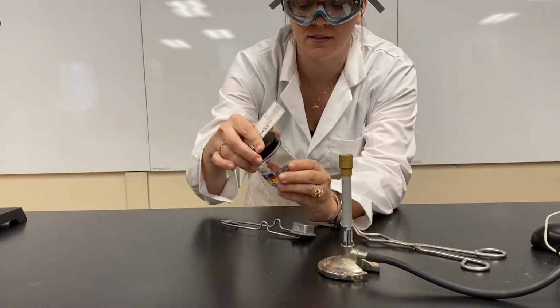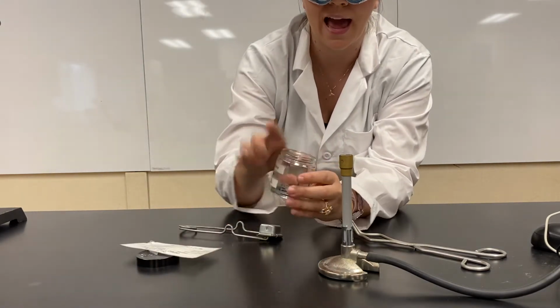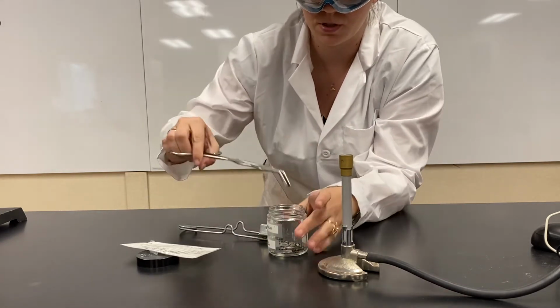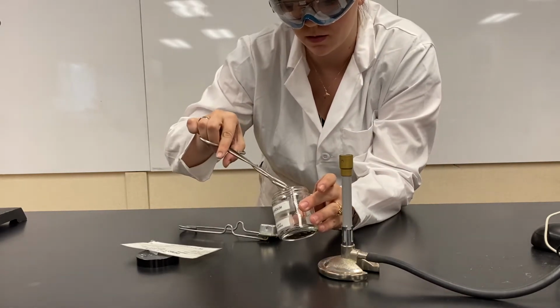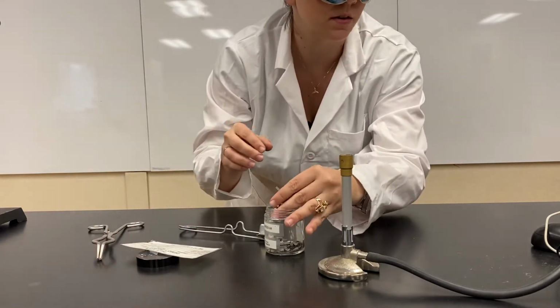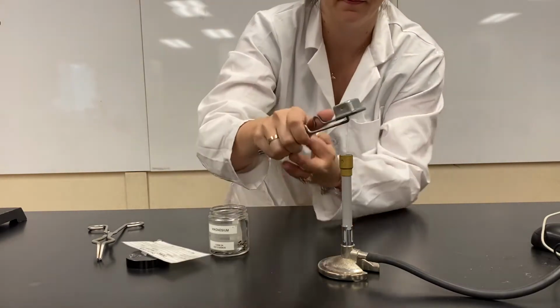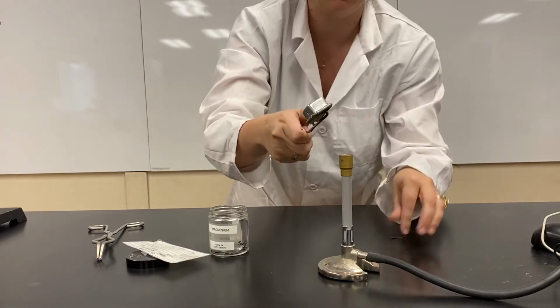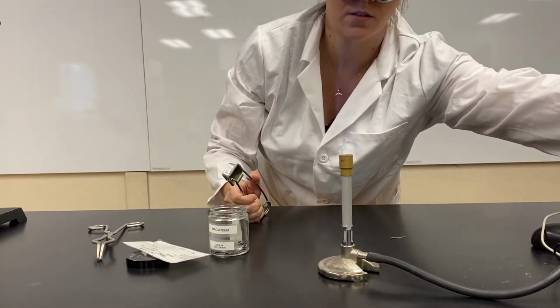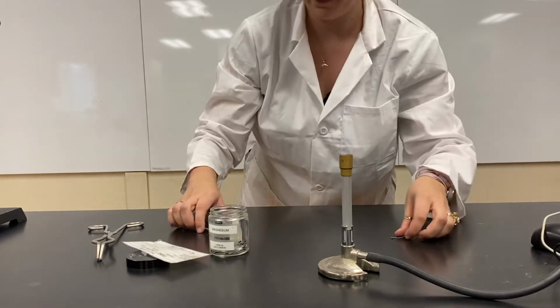We're gonna take some magnesium metal, and we're going to add it with oxygen, okay? Which just means we're gonna burn it. Okay, so we turn on our Bunsen burner. Turn it down a little bit. There we go.